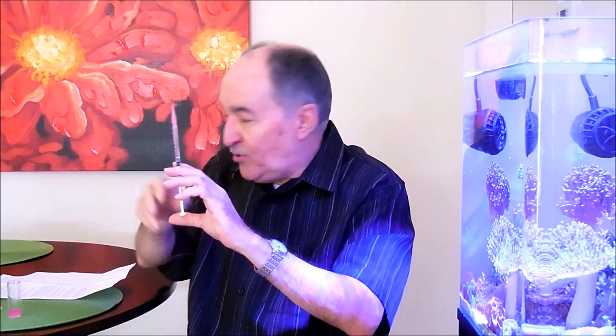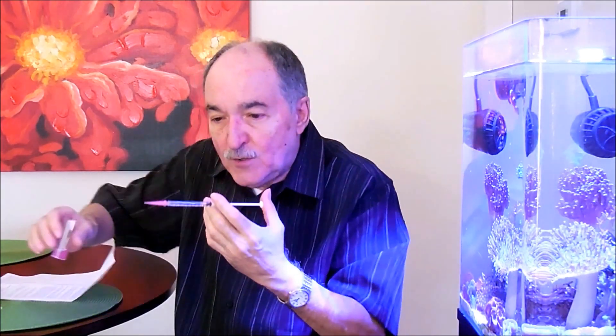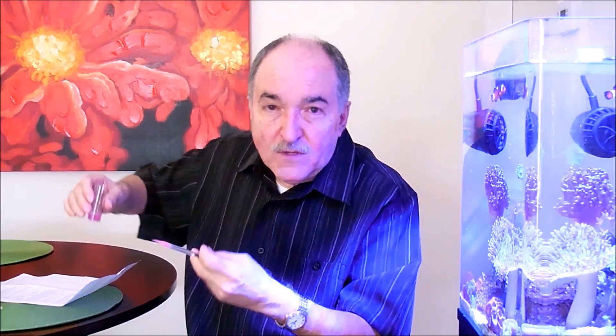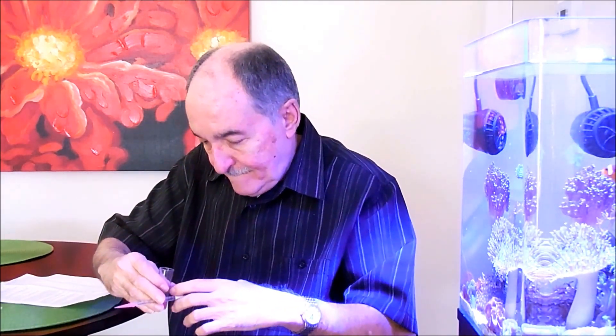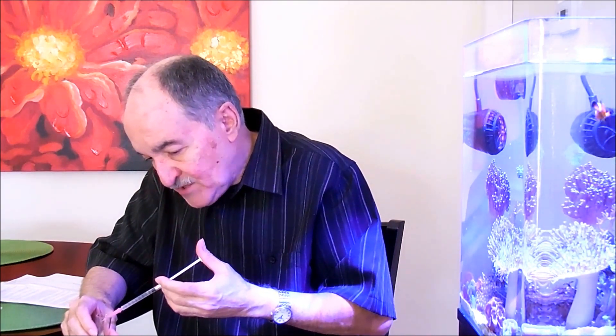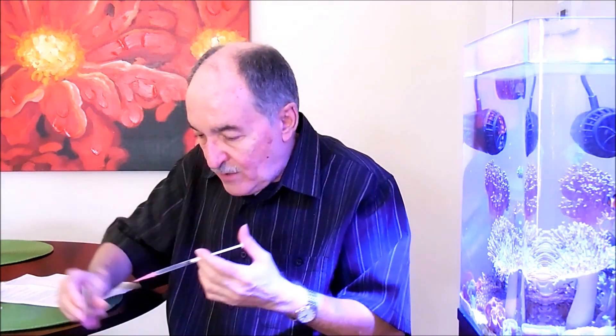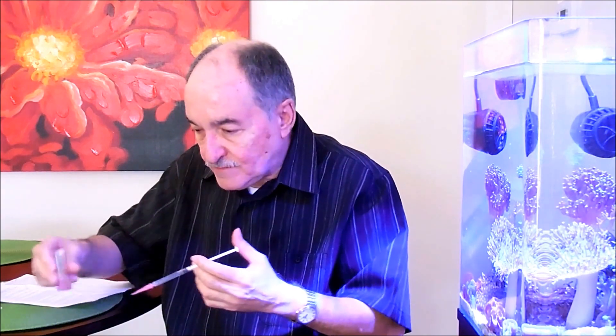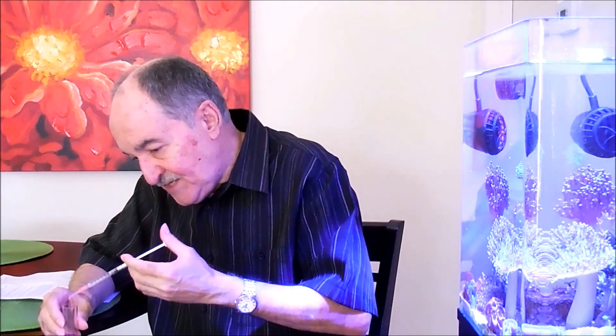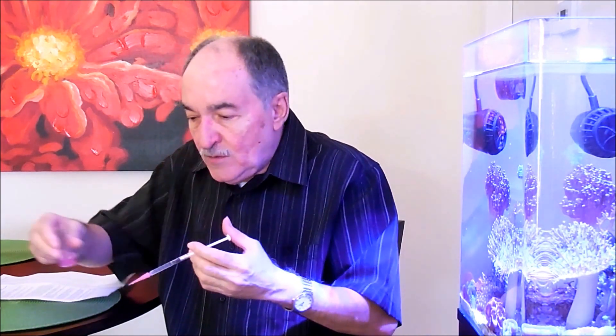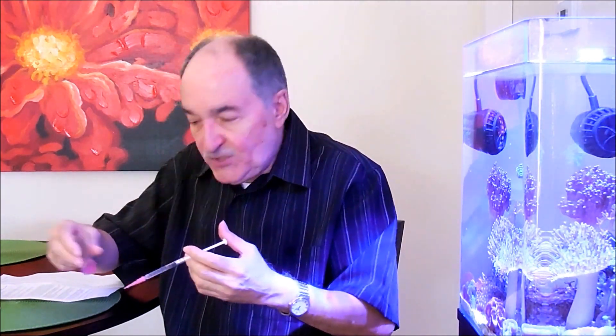Now what you're supposed to do is start to apply the liquid into this vial. What I do is I usually put like half of it because I already know more or less what the amount is going to be, and you swirl. You keep swirling until it turns like a bluish color.